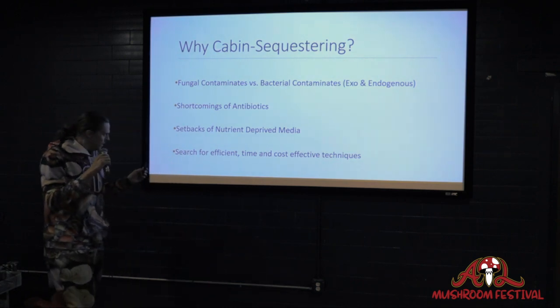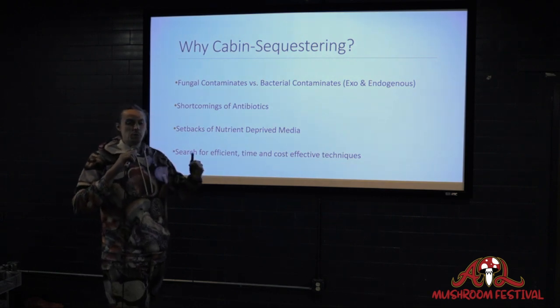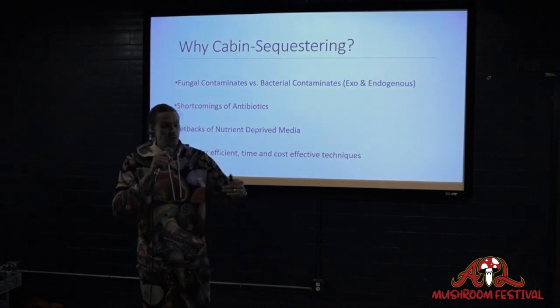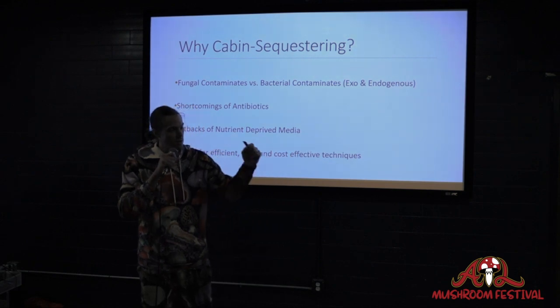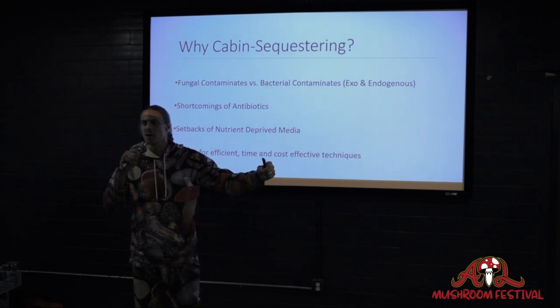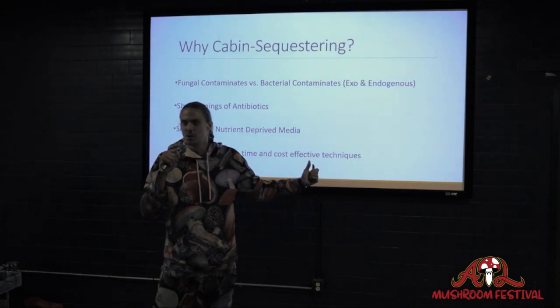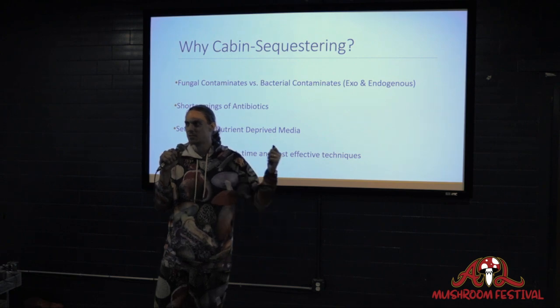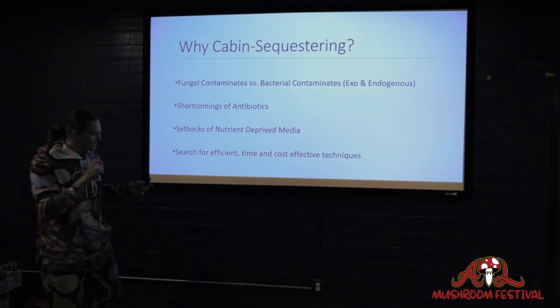And so a lot of people will also try and use nutrient-deprived media. By not providing enough food for the contamination to grow, they assume that eventually the mycelia will grow past the contaminant, and then you can select a clean piece of agar, transfer that to a new plate, and outrun your contaminant. But the problem with that is obvious, right? The mushrooms need food, just like the contaminants need food. So when you don't put any nutrition in your agar, you stunt your mushrooms just as much as you stunt everything else. And so there's got to be a better way, and this is exactly that.